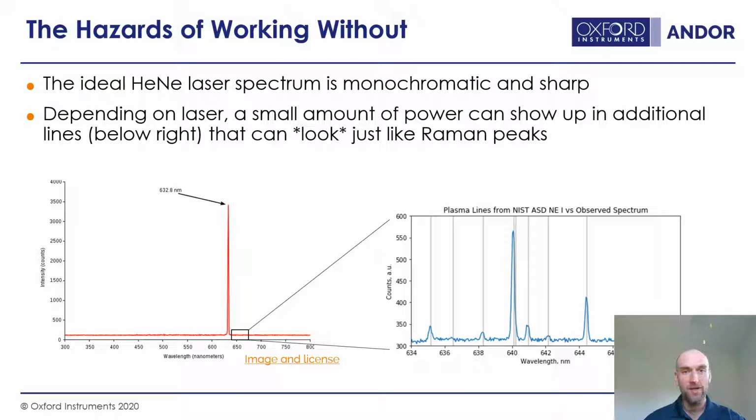So depending on the laser, a small amount of power can show up there, and it can look just like Raman peaks. So just a warning, use a cleanup filter, and even if you're using a cleanup filter, make sure that you look at something inert that's not supposed to scatter in a particular area, and make sure that what you think is coming from your sample is actually coming from your sample.